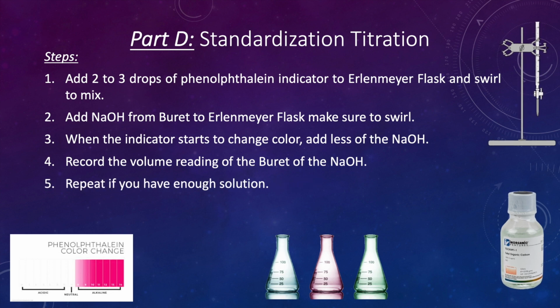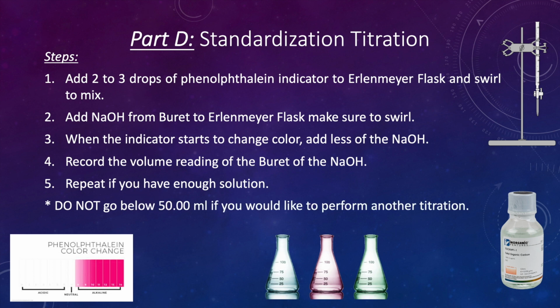And after that, we have to repeat if we happen to have enough solution left. One thing that is really, really important about this experiment is that we do not go below the 50 milliliter mark if we would like to perform another titration.